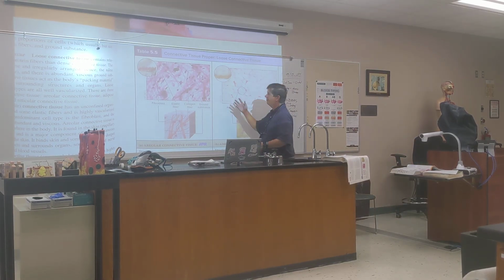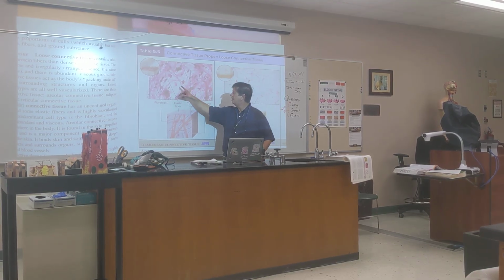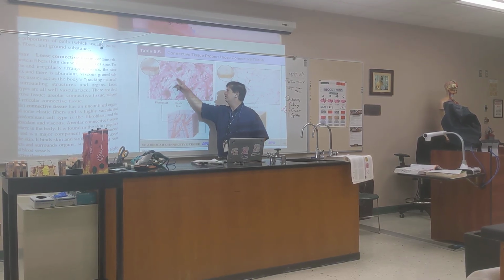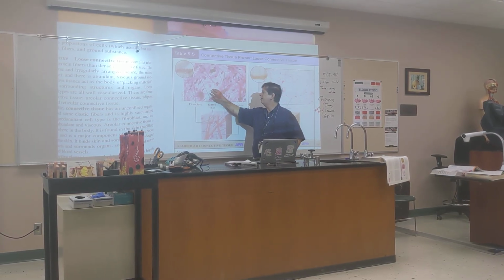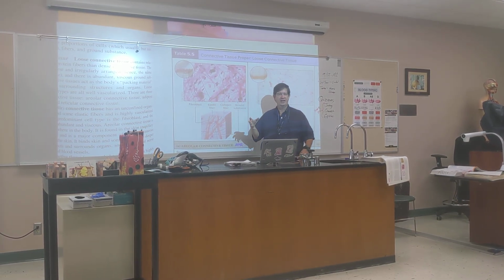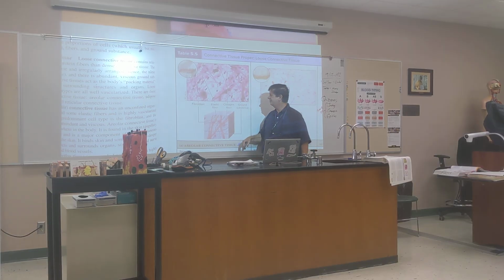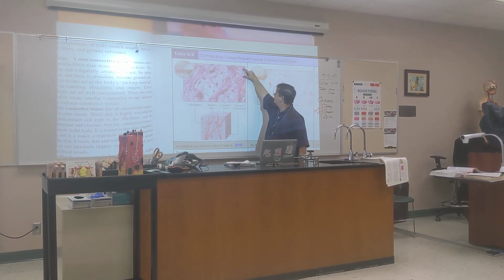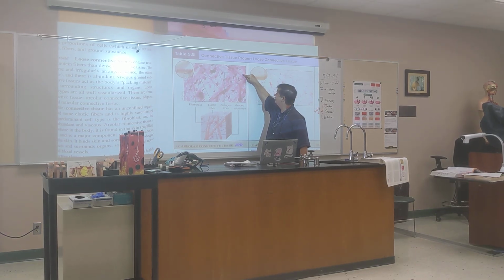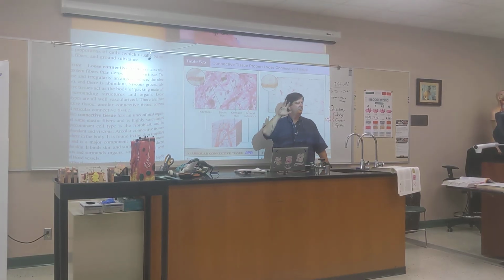But this is areolar connective tissue, and it looks very open, like there's nothing there. You've got fibers for sure, and you've got specialized cells living there. This is not nothing. This is not air. This is ground substance. There are things there. Does that make sense? But it's got a lot of space. And when you look at this areolar connective tissue, it has elastic fibers, and it has the bigger, thicker collagen fibers. See how here the elastic fibers are thin, little stretchy things, and then the thicker ones, those are the collagen fibers. Everybody good with that?